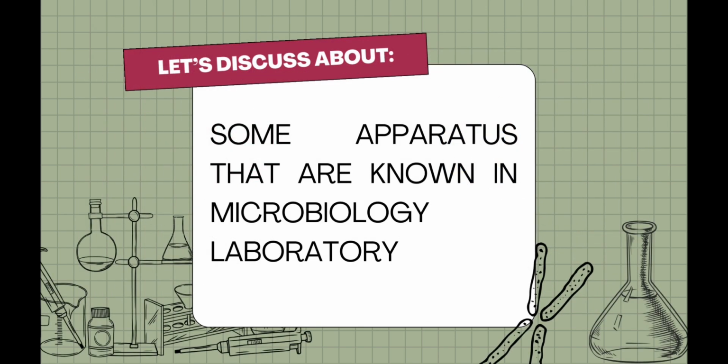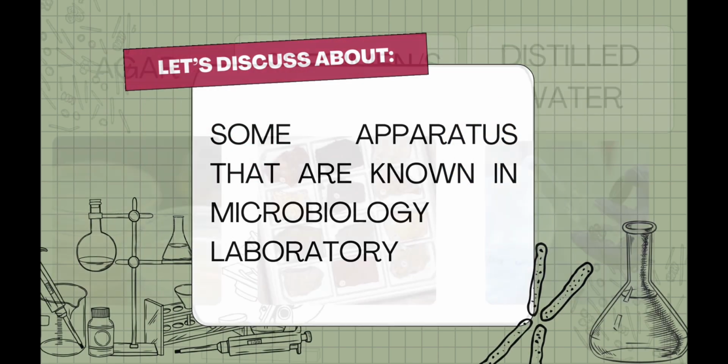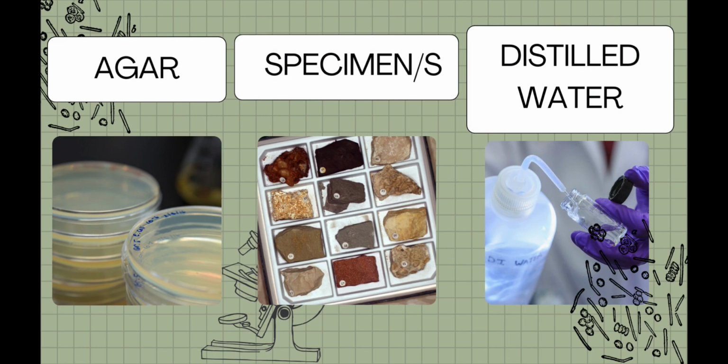To create samples to study microorganisms, we need agar, a gelatinous substance made primarily from agarose and agaropectin, which are obtained from cell walls of red algae belonging to the Gelidiaceae and Gracilariaceae families, which is suitable for performing molecular tests and cultivating microorganisms. Specimen refers to a part or a body of a living or non-living organism that undergoes a rigorous study that serves as a point of reference to various aspects of biology.